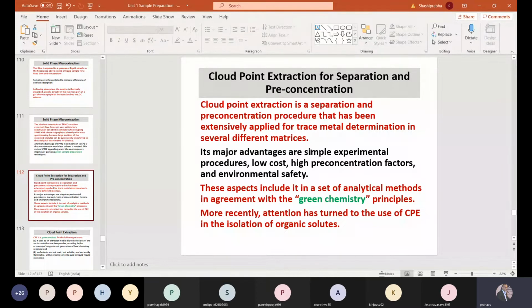And this is also done by liquid extraction, countercurrent extraction, solid phase extraction, and even solid phase micro extraction. These are the salient features of these techniques. But this technique does something else as well. It follows the principles of green chemistry by eliminating completely the use of organic solvents.